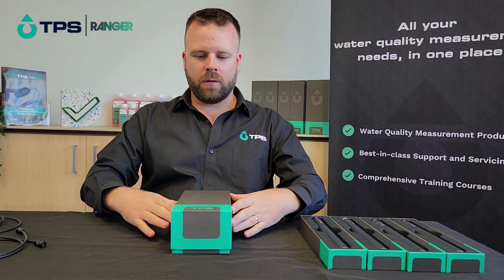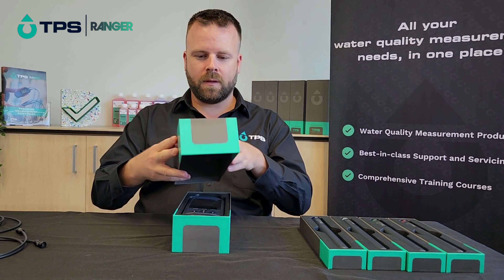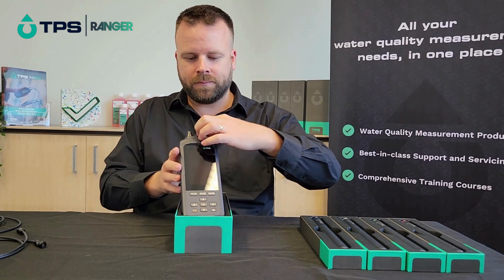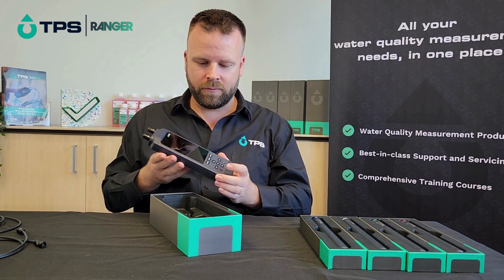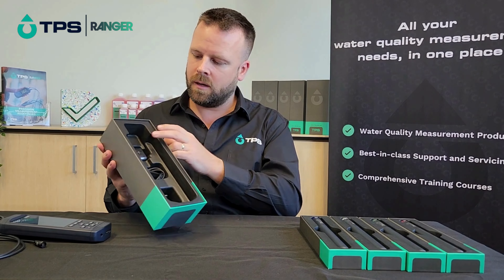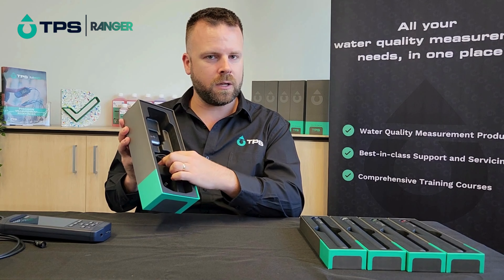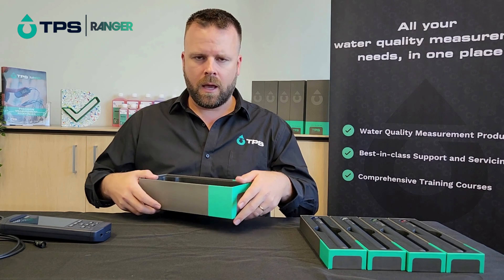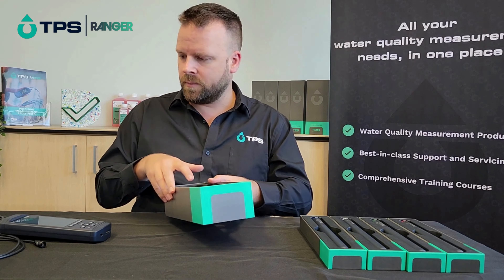First of all we've got the instrument in its box and it's lovely packaging, which is very nice. In the box you've got the wall plug and charge cable, so you can connect them to charge the instrument and also for downloading data, which we'll come to later.